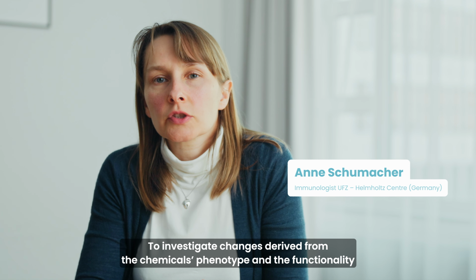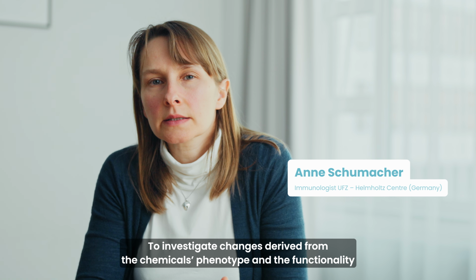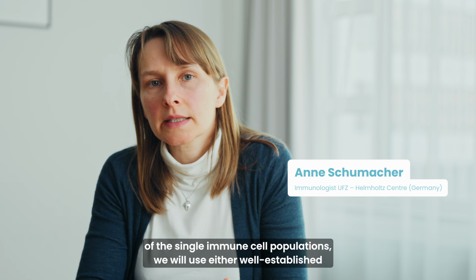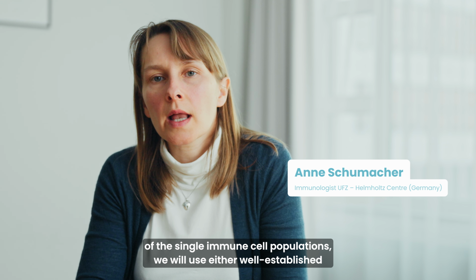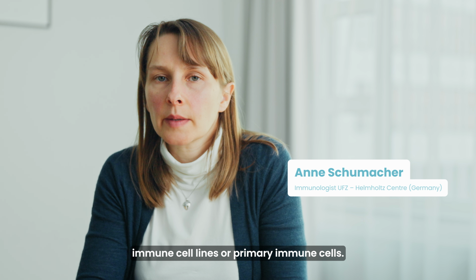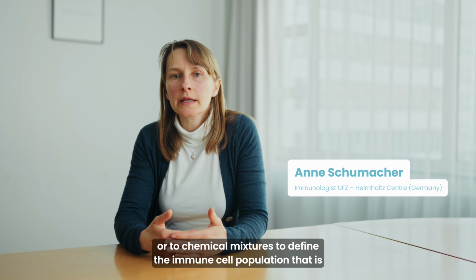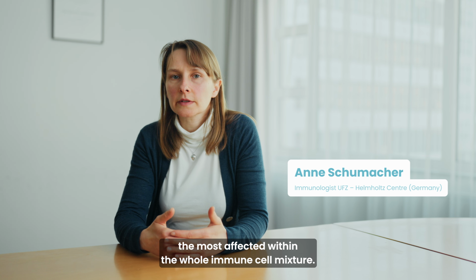To investigate changes derived from the chemicals on the phenotype and the functionality of the single immune cell populations, we will use either well-established immune cell lines or primary immune cells. We will start with a mixture of all immune cells together derived from peripheral blood of human blood donors, the so-called PBMCs. We will expose these PBMCs either to our single chemicals or to chemical mixtures to define the immune cell population that is the most affected within the whole immune cell mixture.